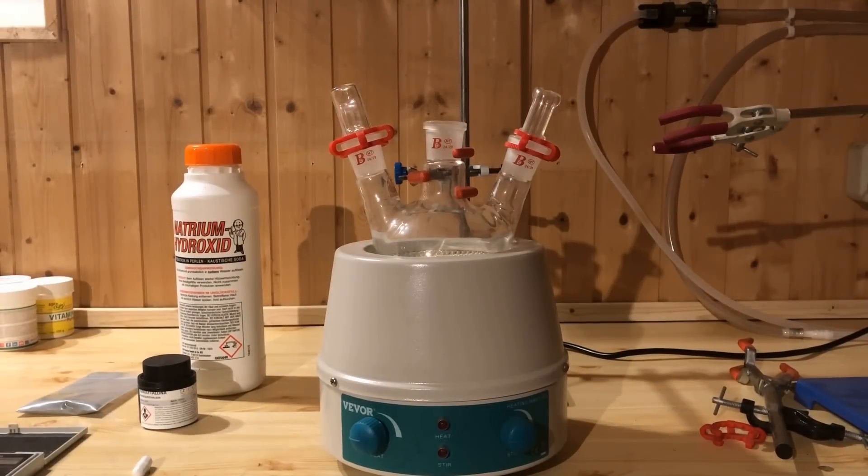A 500 ml round bottom flask with a ground joint is mounted over a heating mantle with an integrated magnetic stirrer.